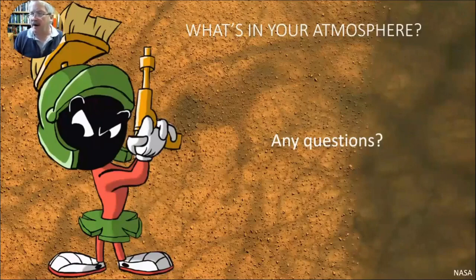And so if you have a specific experiment in mind, you could pick any of these that I've talked about. You can come up with your own. So you might want to know how much pollen is in your air at, say, 200 meters. So you could set this up to do that. Take your sample and then come back into the lab, take a look at the membrane under a microscope, and pick out the pollen grains.